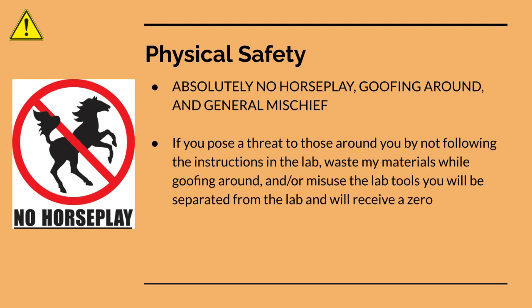That means no running. That means no jogging. It means no to anything that you wouldn't otherwise do in a place like a lab. We walk from lab station to lab station. We keep our hands to ourselves. We sit in our seats when we are sitting. We do not rock them. We do not go up and rock other people's chairs. We act appropriately. We act like we're adults, and we stay safe within a lab, okay?